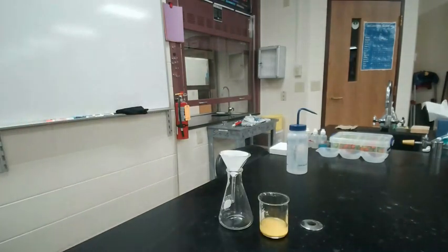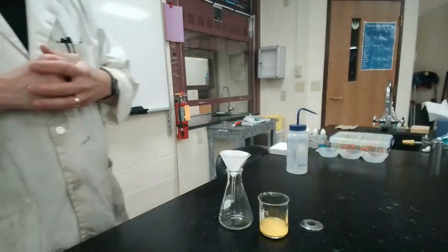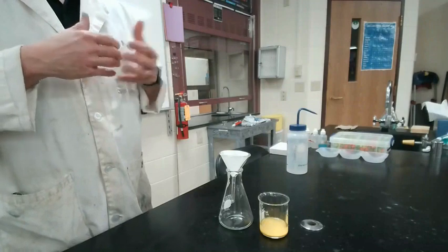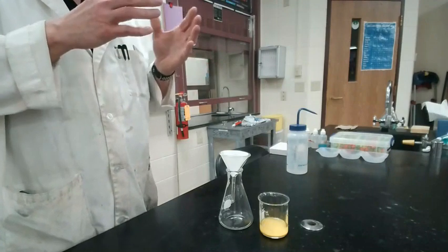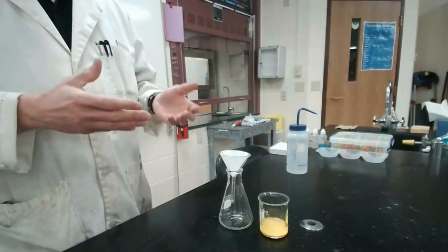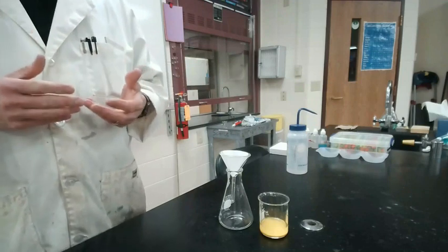Okay. We've now gotten to the point, ladies and gentlemen, where most of our yellow precipitate, the solid, has settled out to the bottom. That's our lead iodide. But there is still sodium nitrate solution in the water above. In this lab, we want to collect the mass of the dry precipitate. So to do that, we have to filter off the liquid that is above it. So we're going to do a process called decanting.